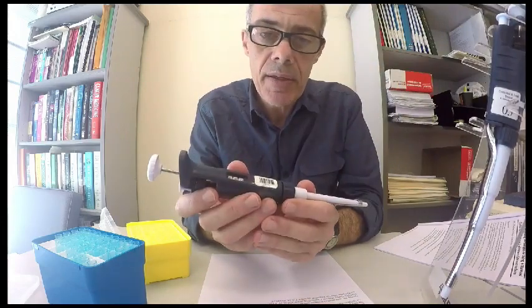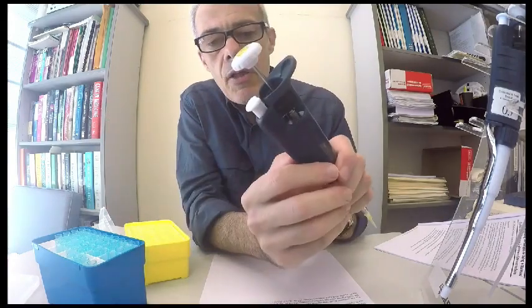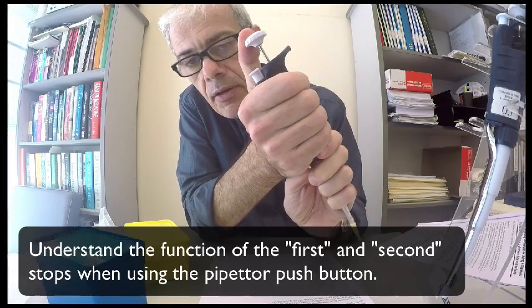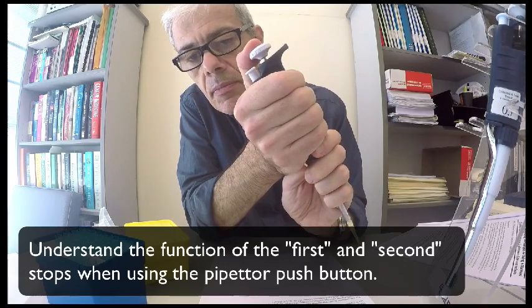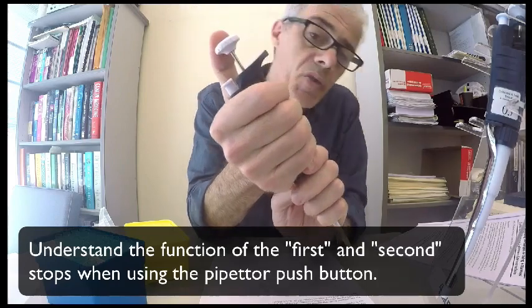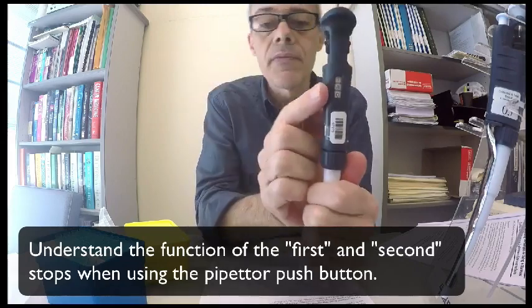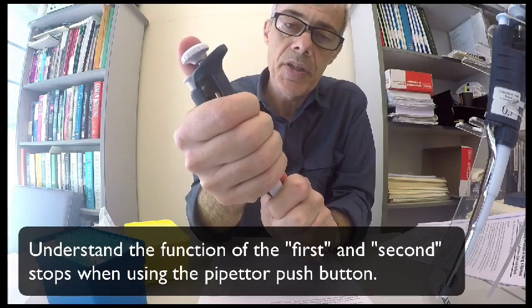Okay, let's assume I want to pipette a volume of 180 microliters. Clearly, I'm going to use the P200 for that. Let's put a tip on there. Okay, so we're ready to go. We've got a tip on there. Now there are two positions that this plunger will work at. There's the first one, and then there's the second one. The first one is calibrated, so when I dispense to the first position, it's going to dispense the volume that's written on this scale here. So that's the first position.